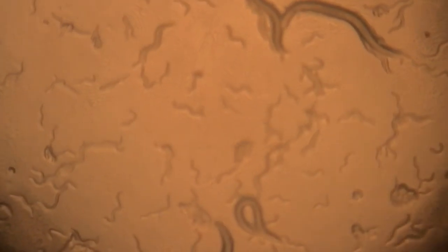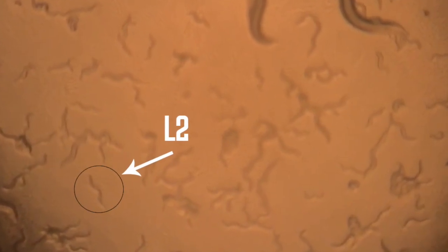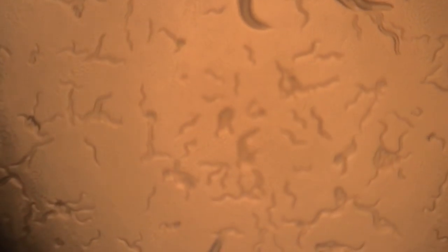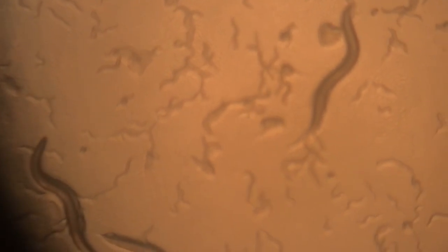At the beginning of the experiment, we had regular C. elegans feeding off the OP50 E. coli strands, which was the wild type worms or the control group. We had to get the C. elegans into a separate petri dish without contaminating them.